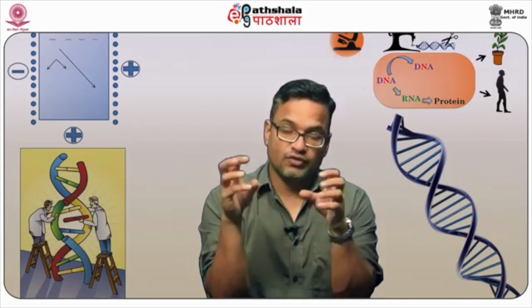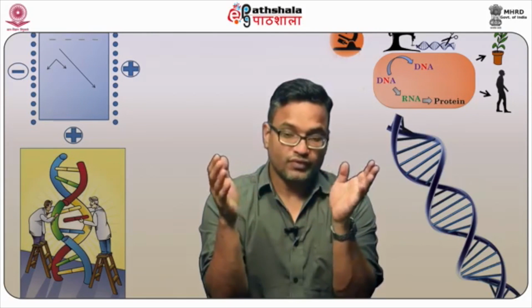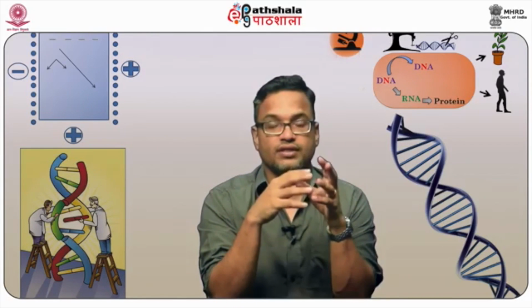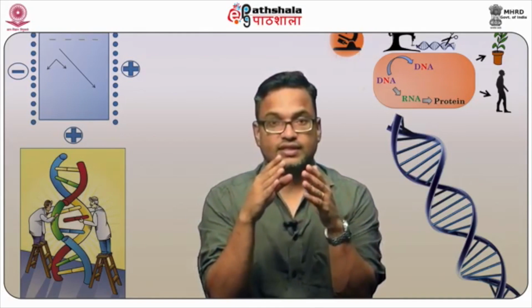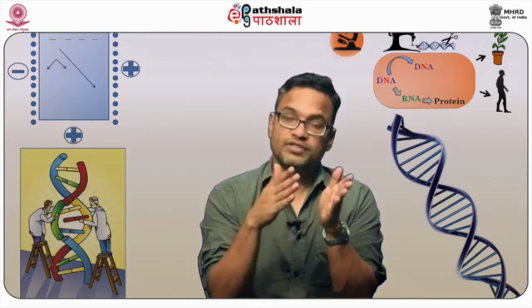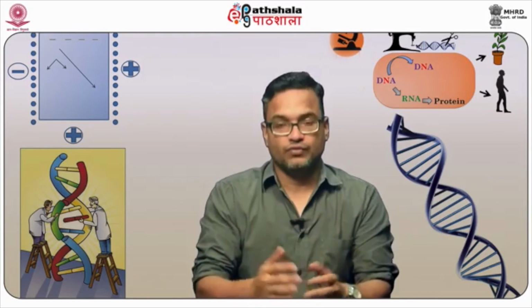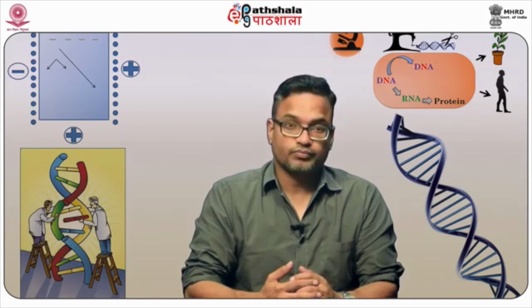So those secondary electrons, or the scattered electrons resulting from the surface, are captured and used to generate the image. The difference between these 2 techniques, TEM and SEM, is the way they generate 2-dimensional or 3-dimensional data, and this will be discussed in future slides and future modules.